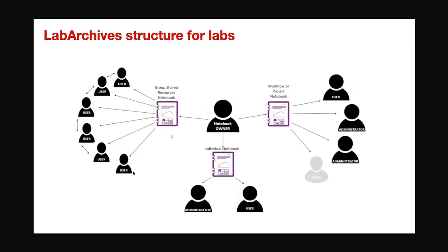So this is another example for a larger lab. Again, the notebook owner is the PI, then people have individual notebooks, and then somebody, usually the lab manager, creates a resource notebook, and then shares it with every user.